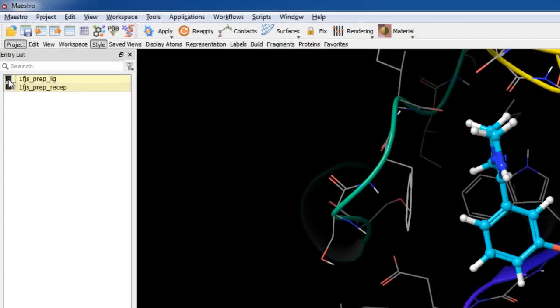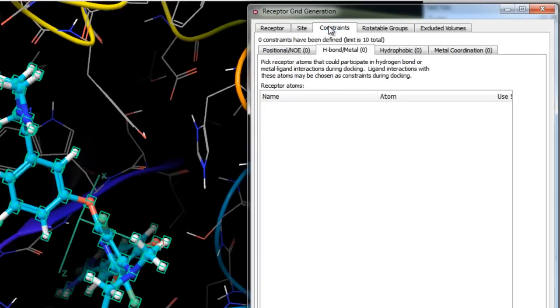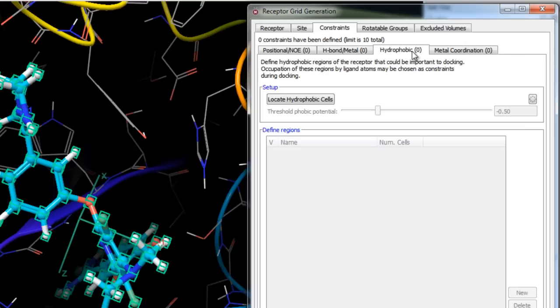The Constraints tab of the receptor grid generation panel is used to define docking constraints for the receptor grids. These are receptor-ligand interactions believed to be important in the binding mode based on structural or biochemical data. Setting constraints enables Glide to screen out ligand conformations or poses that do not meet these criteria early in their evaluation. There are four sub-tabs covering six types of docking constraints.